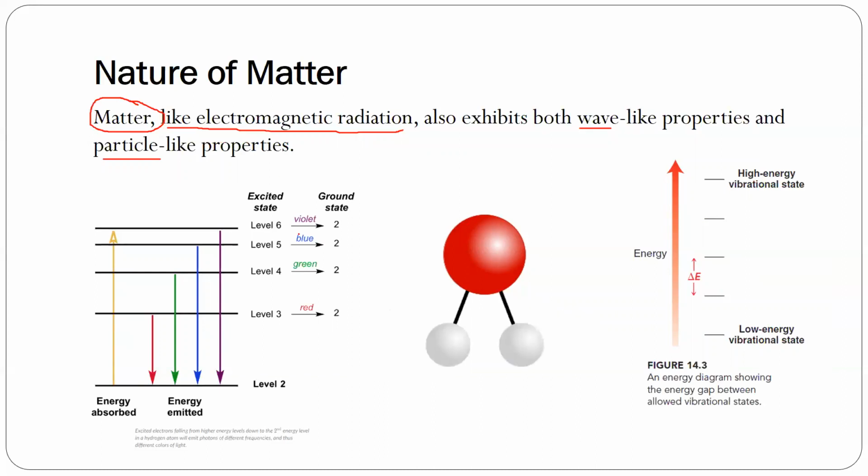Now, let's take a look at this diagram dito sa left side ng slide. Okay? Dahil sinabi natin na may wave-like property siya and particle-like, so meaning meron siyang quantum state. Okay? Ang problema nga lang, hindi tulad ng matter at the macroscopic level.